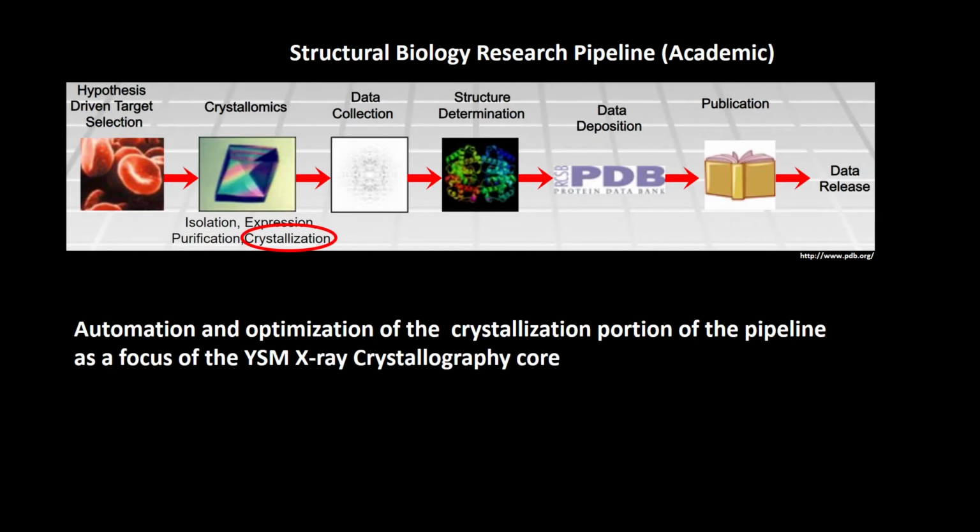So today we'll be focusing on that bottleneck step of obtaining high-quality crystals using automation and protocols that are applicable to small or medium-sized laboratories to improve the often tedious process of the high-throughput steps of condition screening and optimization and imaging and data management.